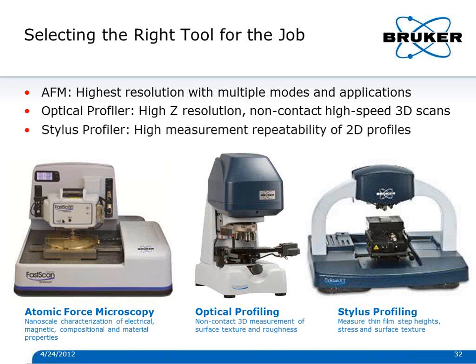And again, the stylus profiler that we discussed earlier, the Dektak XT, is shown on the right. This gives you the ability to collect very repeatable measurements and 2D profiles very quickly. It does give you the ability to collect 3D images as well, and it uses the same software as the optical profiler, the Vision64 software. It's the Bruker software that I was showing you earlier, and that gives you very nice 3D images and 2D analysis of the data.